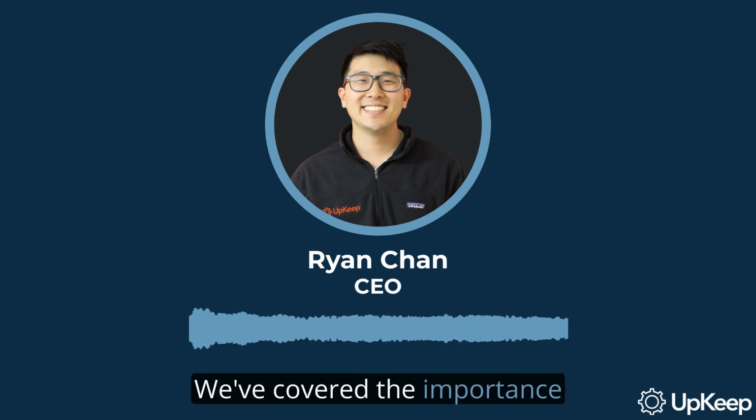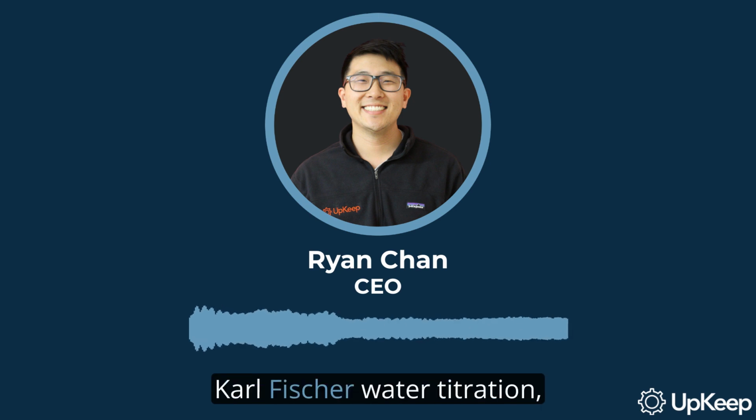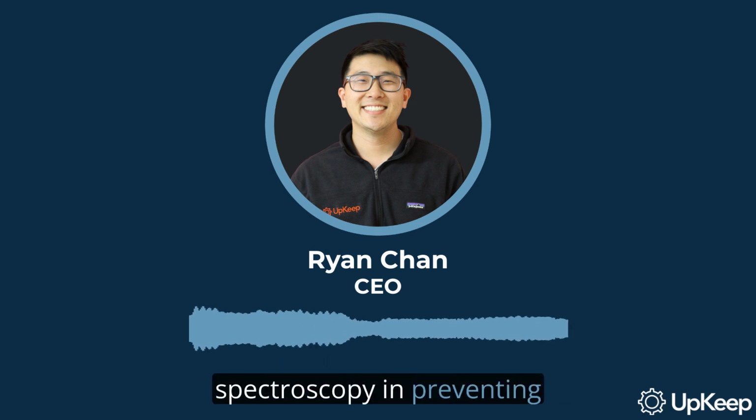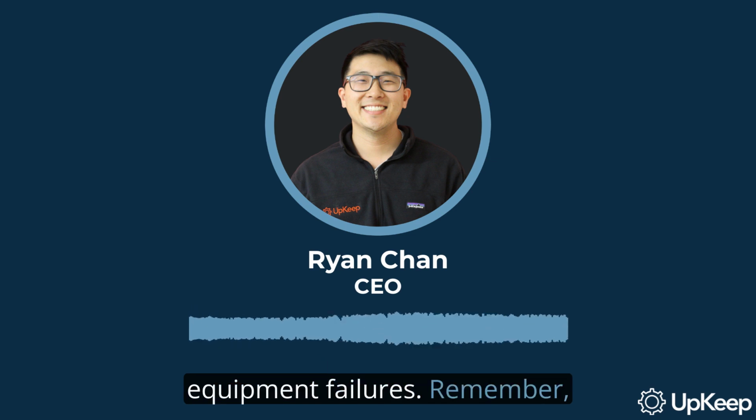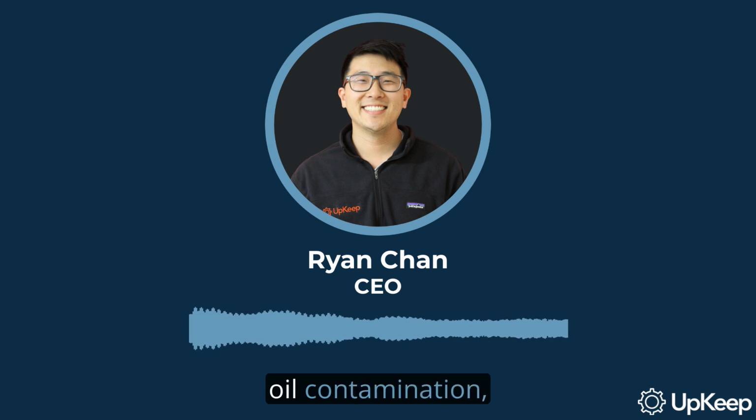We've covered the importance of oil analysis tests like viscosity tests, particle counting, Karl Fischer water titration, and various types of spectroscopy in preventing equipment failures. Remember, 70% of all equipment failures are related to lubricating oil contamination, so these tests are crucial.